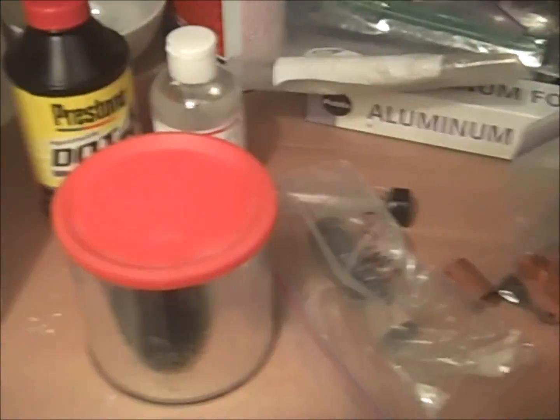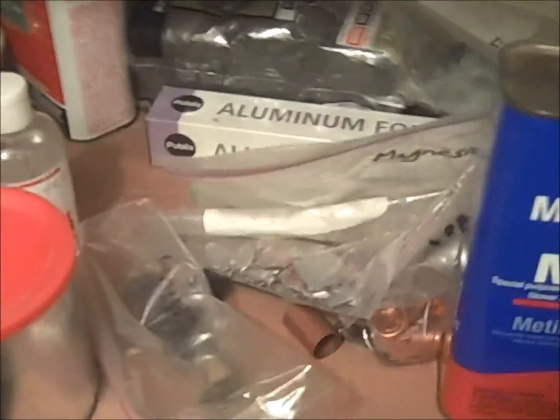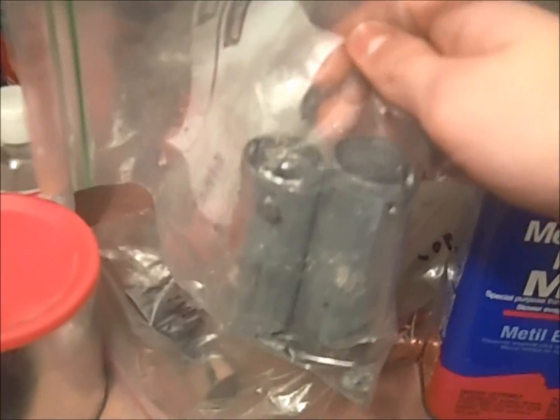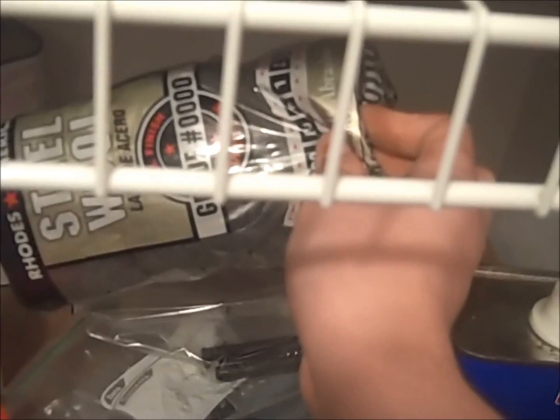Aluminum can be gotten from crushed up, ground down Coke cans, or as aluminum foil, which is very cheap and worth buying. Magnesium is sold as camping sticks at Walmart and other places. One must scrape magnesium shavings off of the stick before they are ignited when they are used. This is zinc, which I got from the cells of a 6-volt battery. These contain carbon, which are also from the same 6-volt battery. This is steel wool, which is a very cheap source of iron. It is sold at places such as Ace Hardware for various jobs.